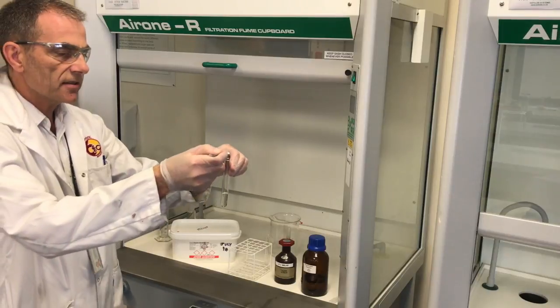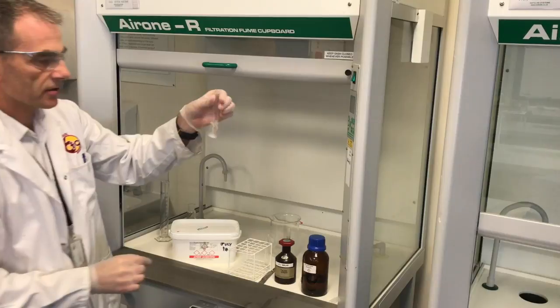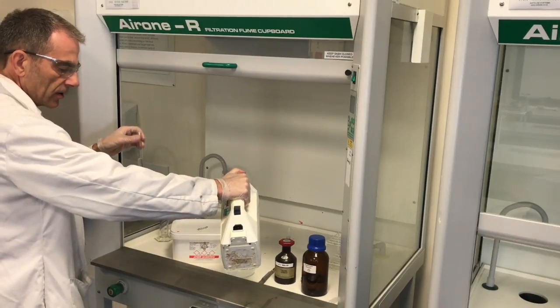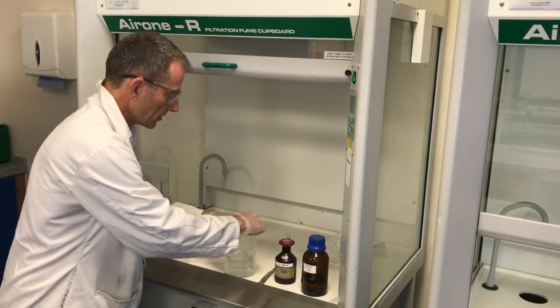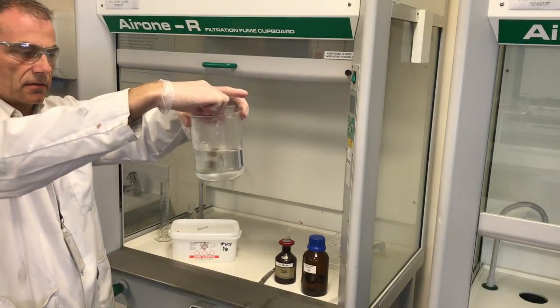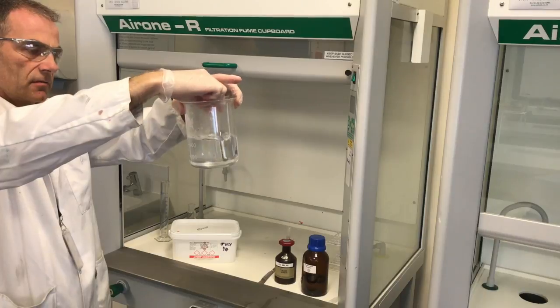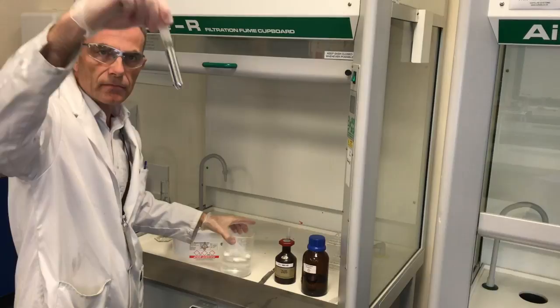Next I'm adding a spatula of glucose powder and just letting that dissolve in the test tube. For heat, I've just boiled the kettle, so we'll half fill the beaker with boiling water, then put the test tube into the boiling water and swirl. And hopefully we'll have a perfect silver mirror.